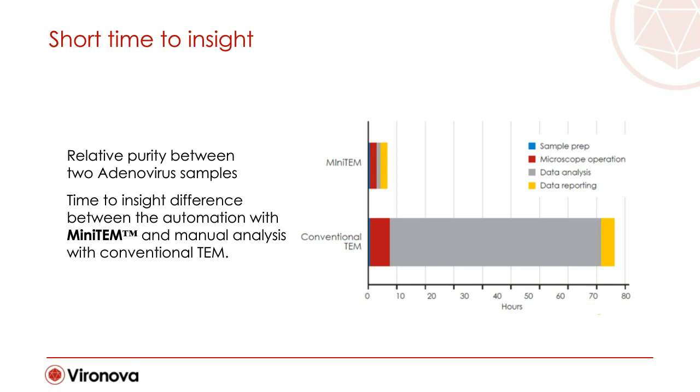The online image analysis takes about an hour per sample in the MiniTEM, providing about 60,000 registered particles. This is not at all a task that is feasible to perform manually, but extrapolated data shows that this would mean about 2 weeks of manual labor.